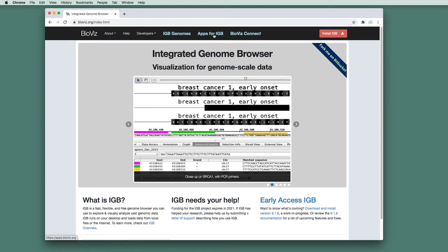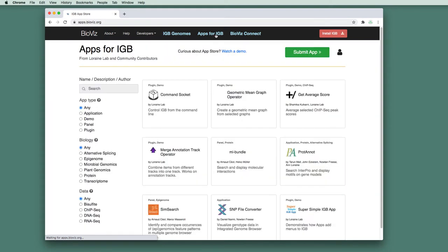So to do that, you simply just go to our website, bioviz.org, and click Apps for IGB. And this will take you to the IGB App Store.